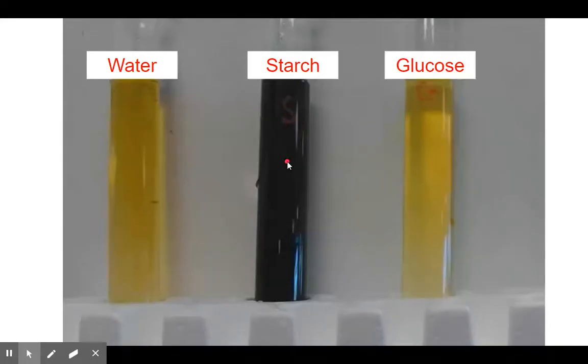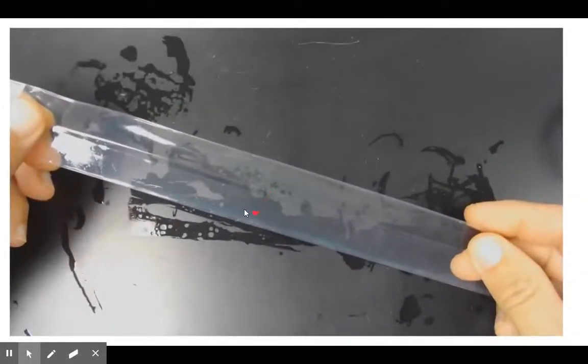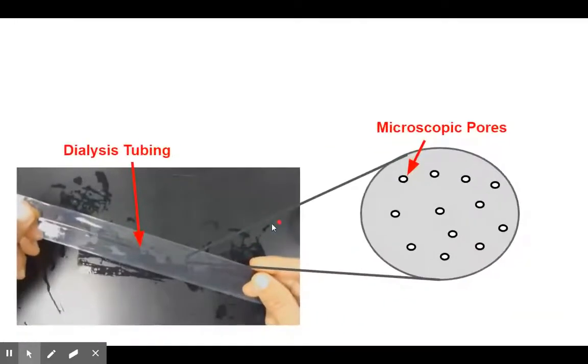Now we got the indicators down, we are ready to look into the lab. The lab is going to be looking at a dialysis membrane. There's no way to really look at diffusion of a cell too easily under the microscope, so we're going to be making an artificial cell using this dialysis membrane. If you look real closely at the dialysis membrane, it has microscopic pores. These microscopic pores act just like a cell membrane where stuff can go in and out of this artificial cell depending upon if it's small enough to fit through the pores. This is why it's going to be considered semi-permeable.